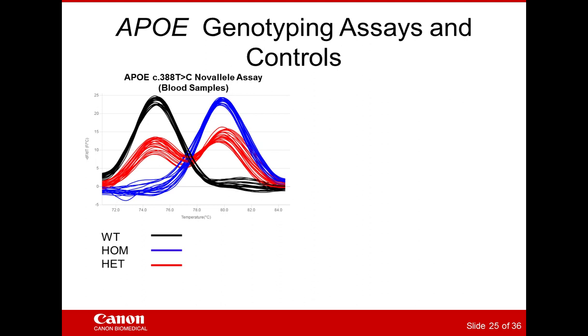From a data perspective, it looks quite different than the copy number data that we just looked at. From a protocol perspective, though, it is very similar. It is just a simple PCR followed by a melt. The cycle numbers are higher than what we see in copy number because we allow these reactions to plateau out to the genotyping, since we're not looking at relative fluorescence changes. But we wanted to show some sample data sets for this.